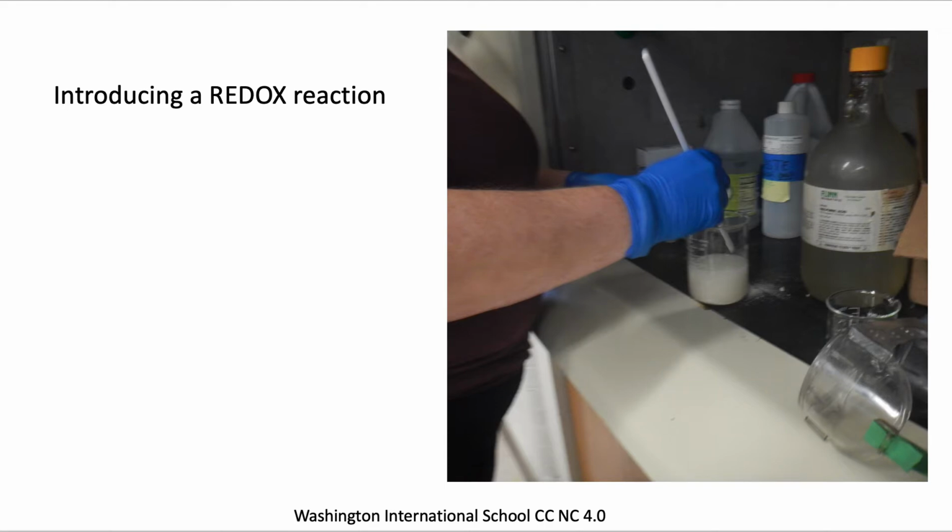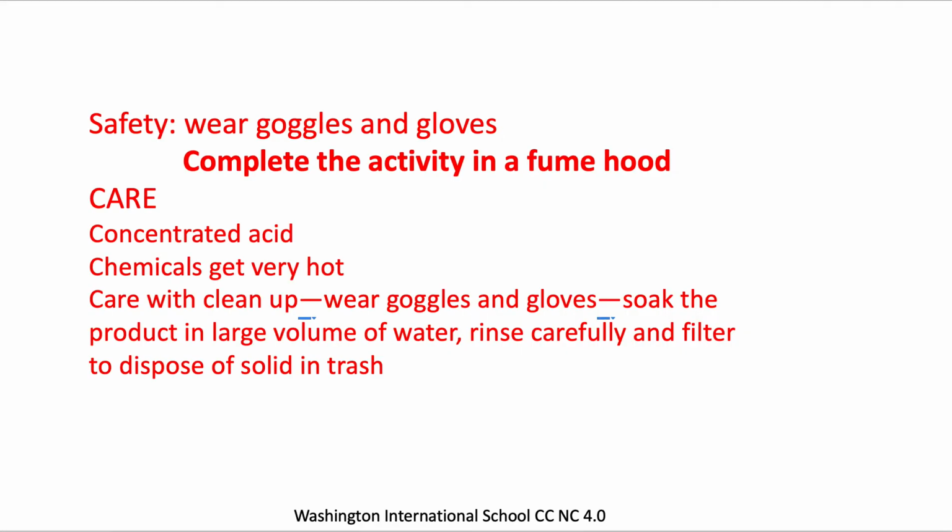We're going to look at redox with quite an intriguing reaction, but before we do it we need to know some of the safety procedures: wearing goggles and gloves, and complete the activity in a fume hood. Be careful because it's concentrated sulfuric acid. It's an exothermic reaction and gets very hot.